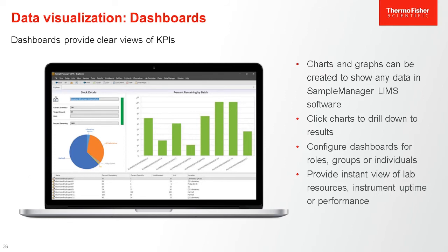Any entity in SampleManager can be shown in a chart, graph, or table as part of dashboards. Dashboards can be created to show KPI performance to managers, or to show analysts at which stage of the process they're at, or anything else you need to quickly get a graphical view of.